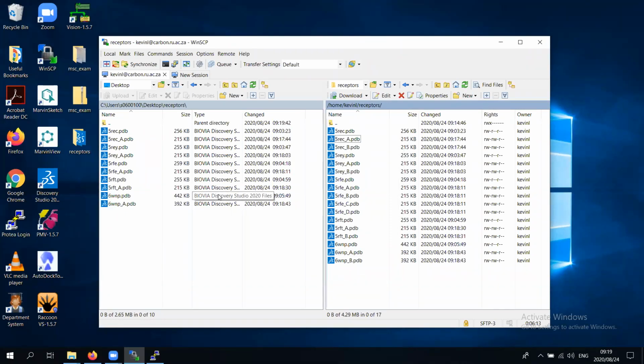Now, the thing is with AutoDock Tools, it's a really powerful program, and it's a free program, so I don't complain if there are any issues with it. But what I found is that if you restart it regularly and have a fresh workspace, then some of the issues go away, not all of them. So we must be careful, and we must be patient using AutoDock Tools.